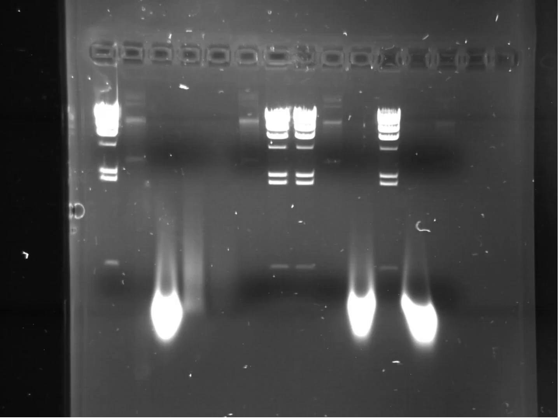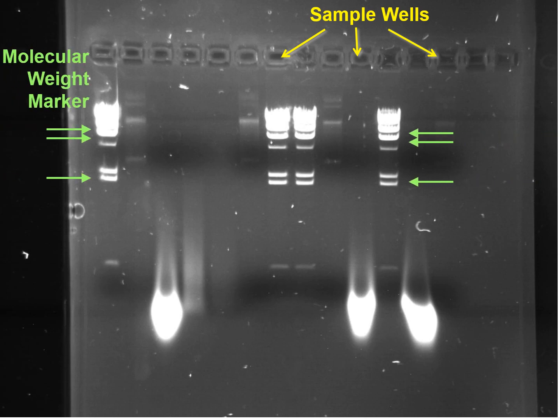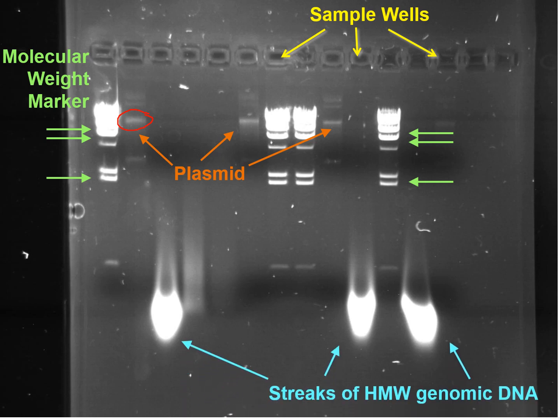Let's take a closer look at these. Up here are the sample wells — this is where you loaded the samples. This is the molecular weight marker — I'll talk about that in a minute. Each of these bands represents a different size of DNA fragment. Here are the plasmids — Jen and Jaylin, there's your plasmid right there, looks pretty good. Here's the high molecular weight genomic DNA. Normally genomic DNA stays up in the sample wells because it's very large, but this particular sample has been pre-fragmented, so it ends up as a blob or smear near the bottom of the gel.